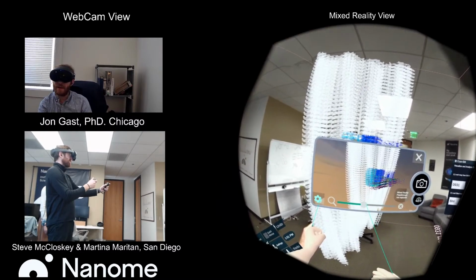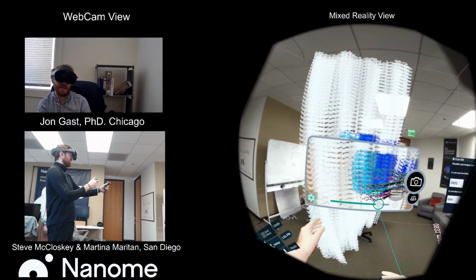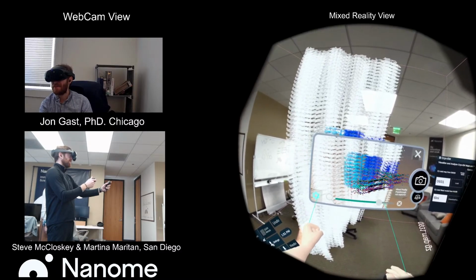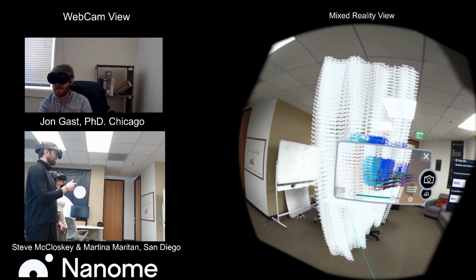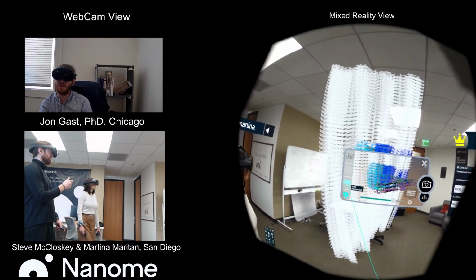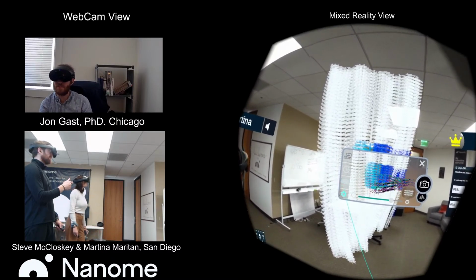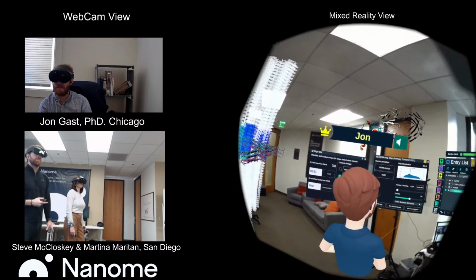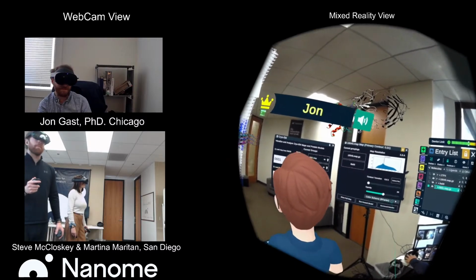And then, compare different areas of the map, I would say yes, but I would love any clarification as to what sort of areas they would want to compare, because with box around selection, you can select any set of residues. They don't just have to be consecutive or a part of a whole chain, but really any individual residue can be selected for that box around selection.